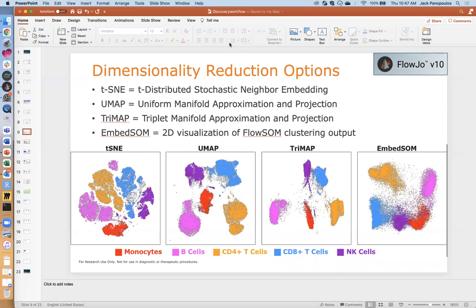All right, so Anna asks, are there any plans to include non-random t-SNE initialization based on PCA or other global distance preserving method option in FlowJo soon? Yes, there is. We have been talking about that, and I know they are going to implement it. The question is whether they're going to implement it in version 10 or version 11.